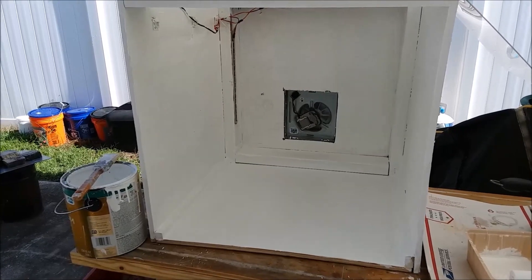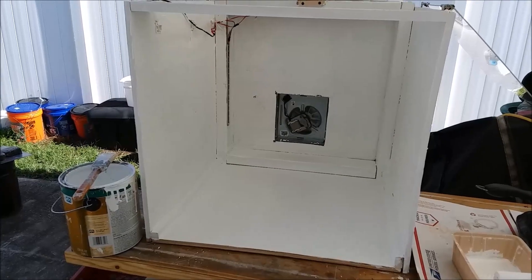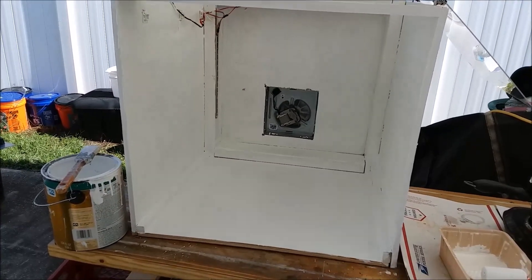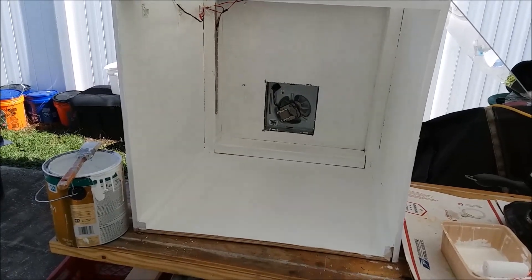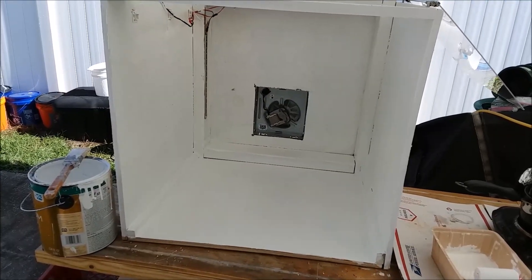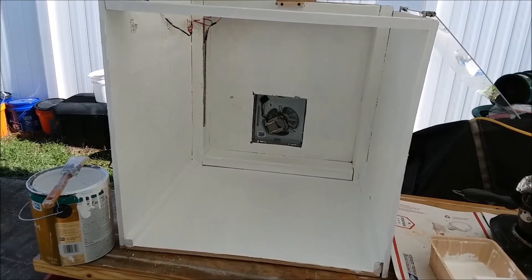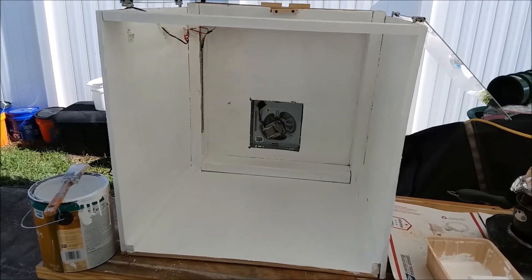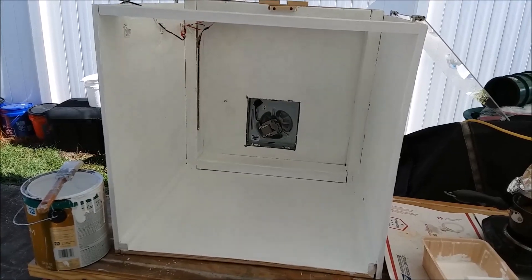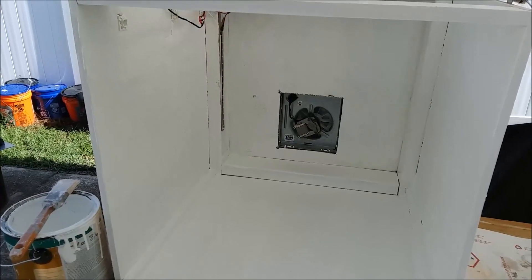There's the second coat — it's looking pretty darn good. I might put a third on just for added protection from chemical splashes. It's amazing how slapping a fresh coat of paint on an old pile of lumber can make it look like a million bucks — that's a secret real estate agents have known for a long time. If you want to get top dollar for your house, just slap a fresh coat of paint on it and it'll more than pay for itself.